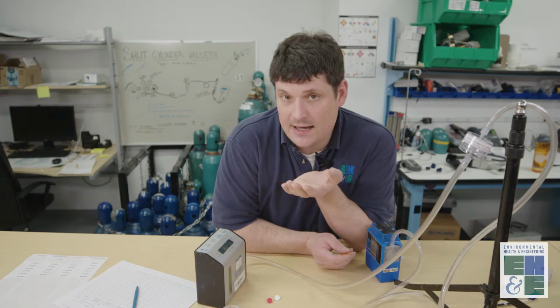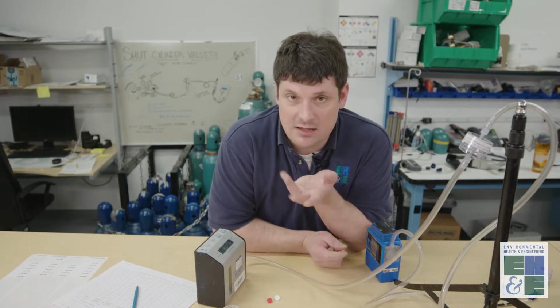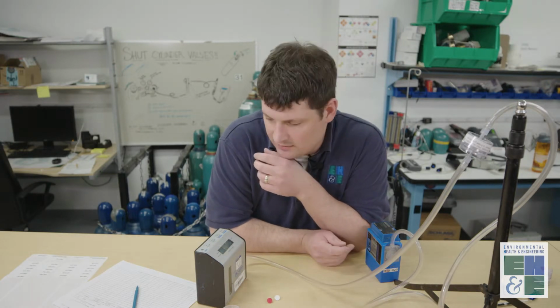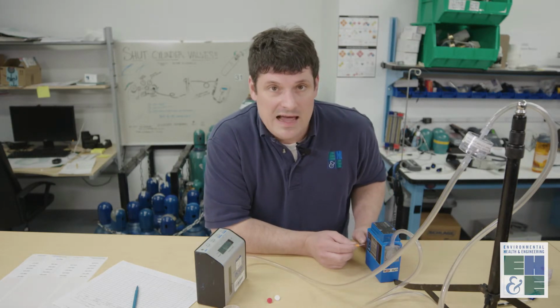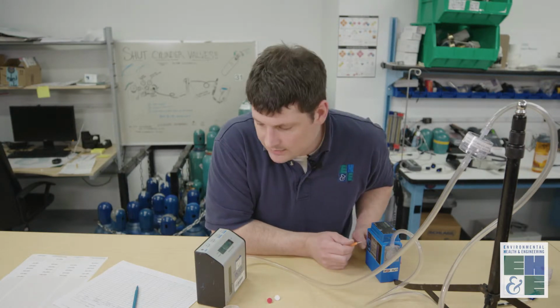This does take time, and if you have multiple pumps that you have to set at the beginning of a day, for example, you want to make sure you allow plenty of time to do this process. So often we'll show up at least 30 minutes, if not an hour, before we want to begin sampling, just to make sure everything is set up.